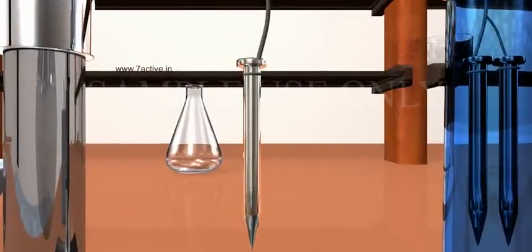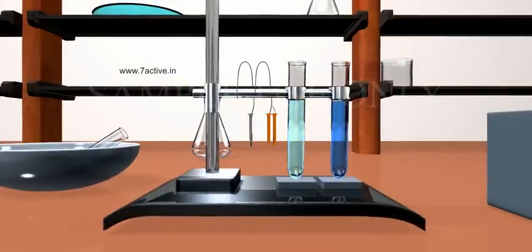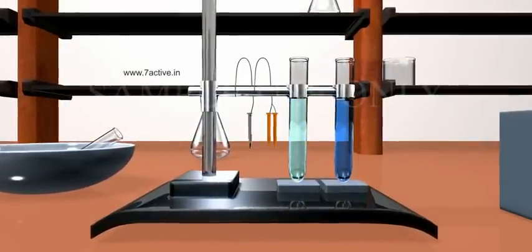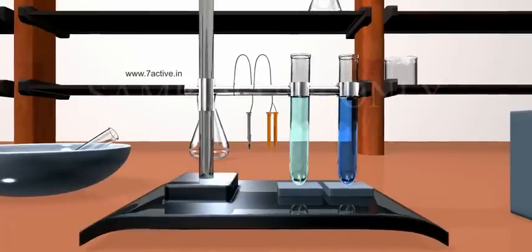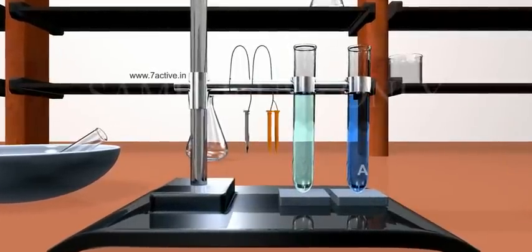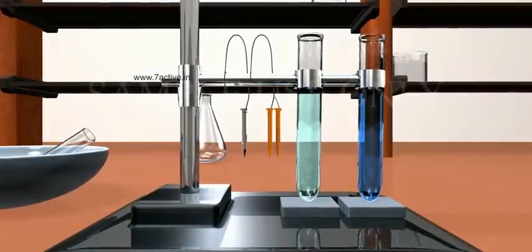After 20 minutes, take out the iron nails from the copper sulfate solution. Compare the intensity of the blue color of copper sulfate solution in test tubes A and B. Also compare the color of the iron nails dipped in the copper sulfate solution with the one kept aside.